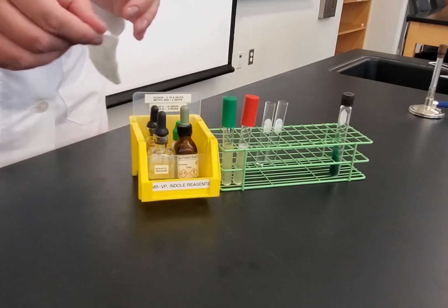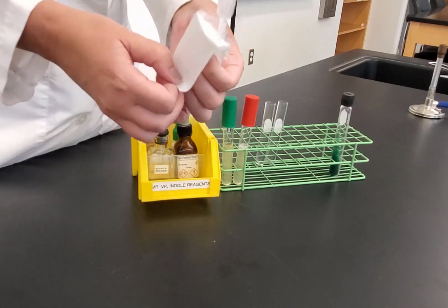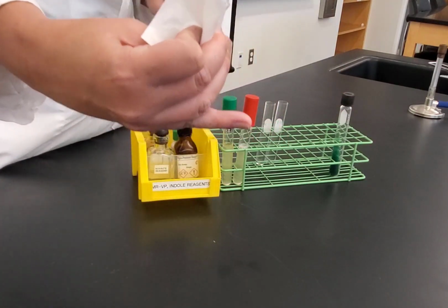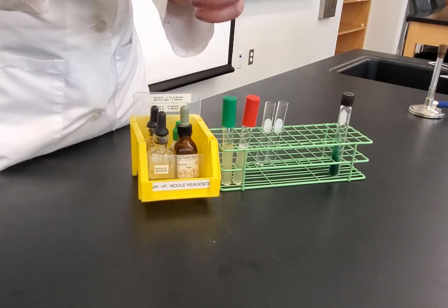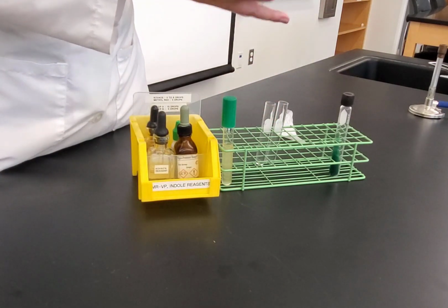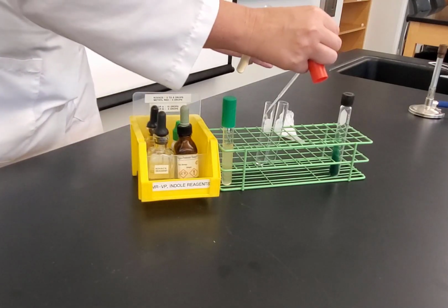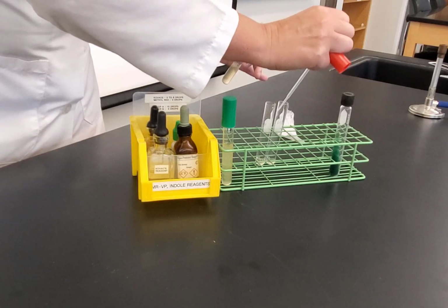So to do that, I'm going to take my transfer pipette. This is sterile, it's individually wrapped, and I'm going to just peel this open. Now, on these transfer pipettes, there's a little line at the top, and this little line is how we know where 1 milliliter is. I need 1 milliliter of this into each tube. So I need to make sure that I don't contaminate my dropper, so I'm careful when I take it out. Let me just vortex to mix before I go in there. And I'm going to take the cap off, and I'm going to draw up to that line and then add it to the tube. And then same thing, draw up to the line and then add it in.